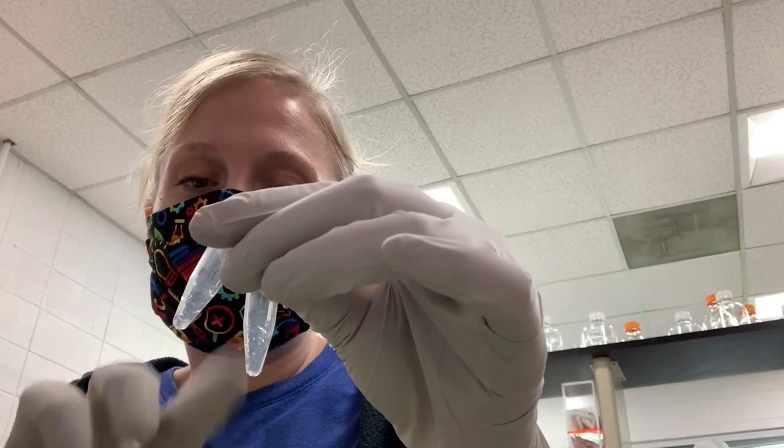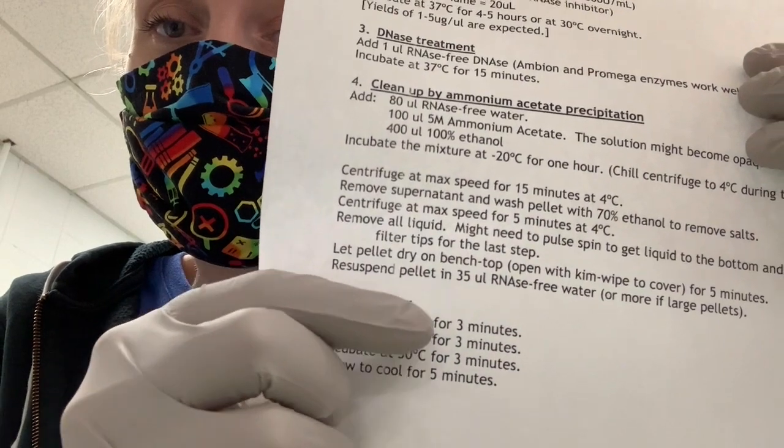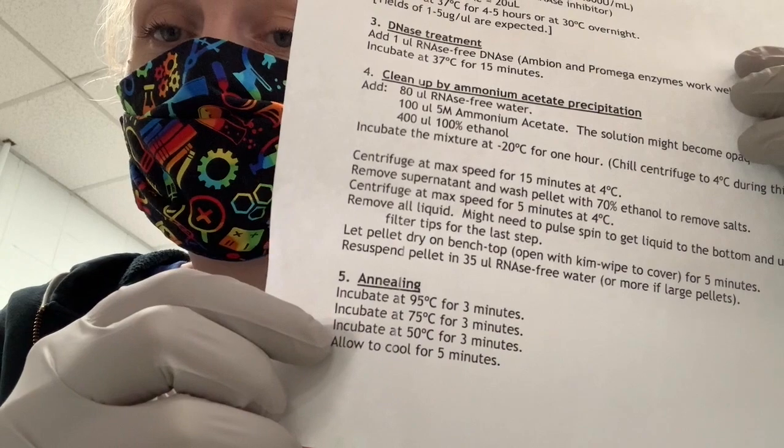I prefer to just leave my samples in these 1.5 ml tubes. After my pellets are resuspended, I will spin them down, just a pulse spin in the centrifuge, and then I will put them in the hot block that I used for my 37-degree incubation, which I have set at 95 degrees. And so this protocol says 95 degrees for 3 minutes, 75 degrees for 3 minutes, and 50 degrees for 3 minutes, and then allowing to cool at room temperature.